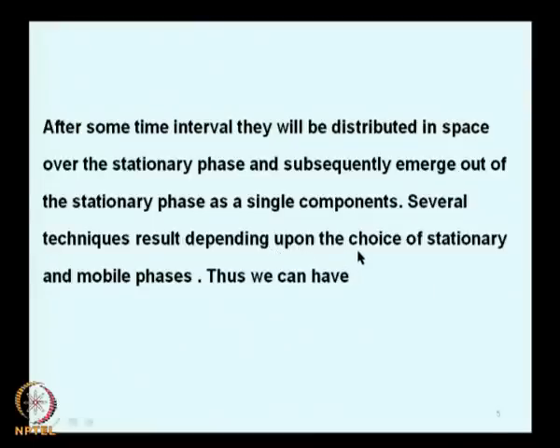Several techniques result depending upon the choice of the stationary phase and mobile phase. We can have a number of stationary phases and a number of mobile phases. That is how we have a number of chromatographic techniques. And in the next slide, I am going to show you this. We will discuss what are the different types of chromatography and how we can employ them for our separation purposes.